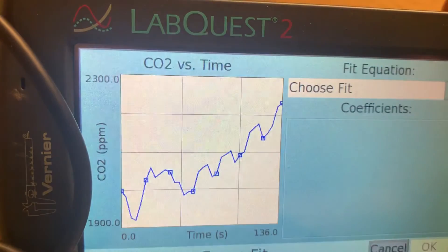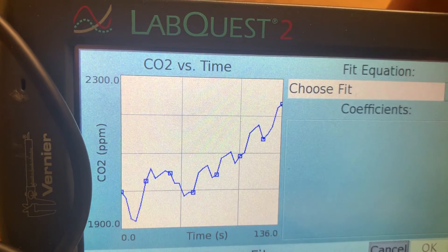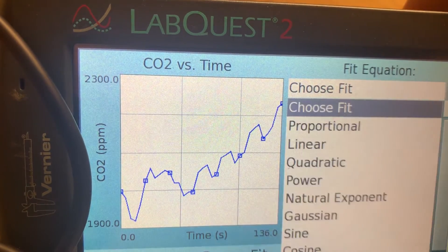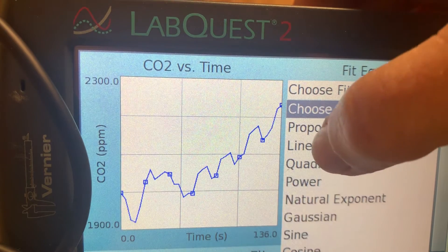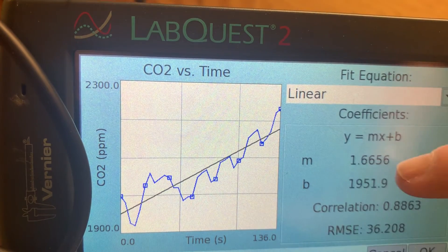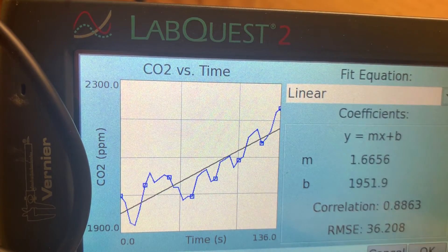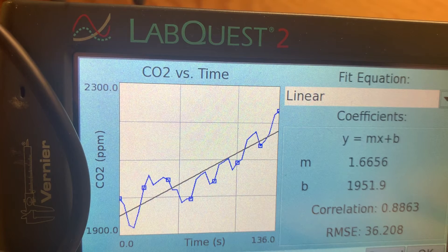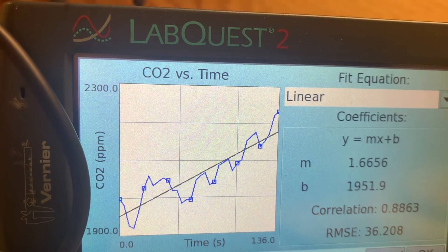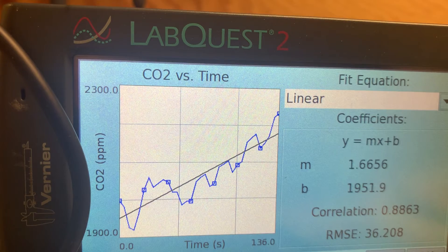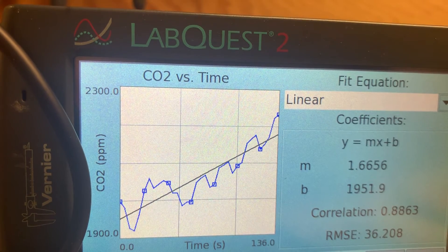Select the CO₂ probe, then when you choose your fit, pick Linear. The M value is the slope — right now the slope is 1.6656 — and that tells us the rate of change of carbon dioxide.